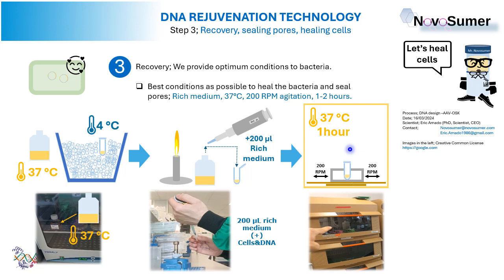Let's go for the next and last step. Plating the cells is just plating the cells. Okay, let's go for it.